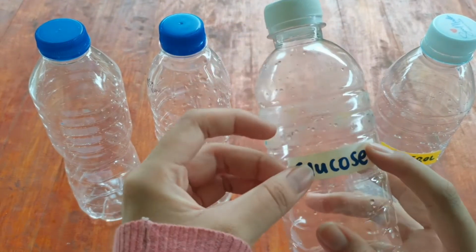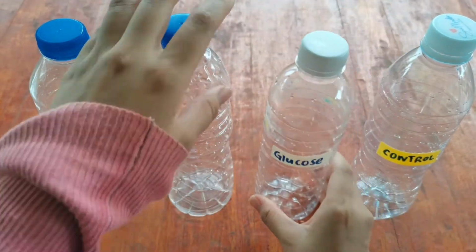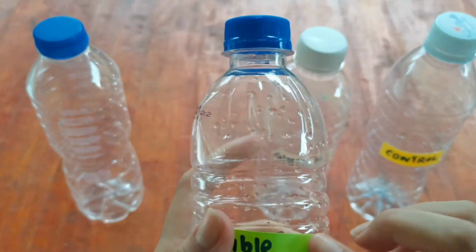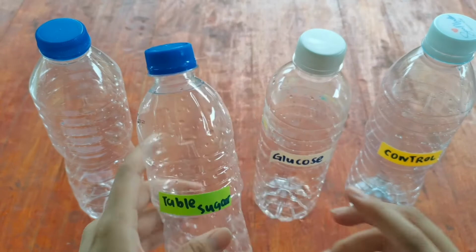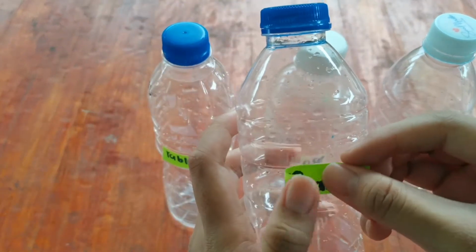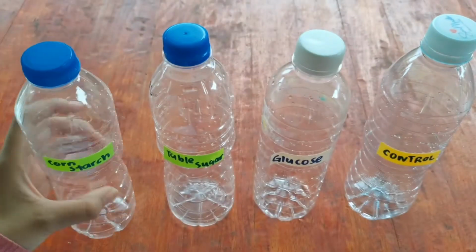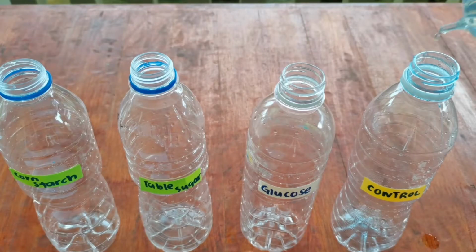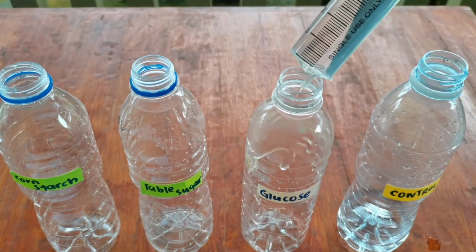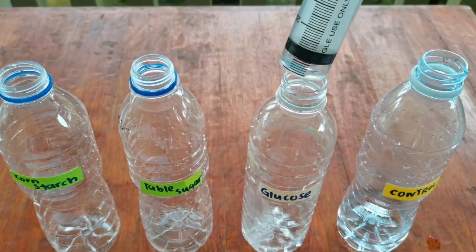Here I'm using a sticky note for labeling. After that, fill in each of the empty plastic bottles with 70 ml of warm water.